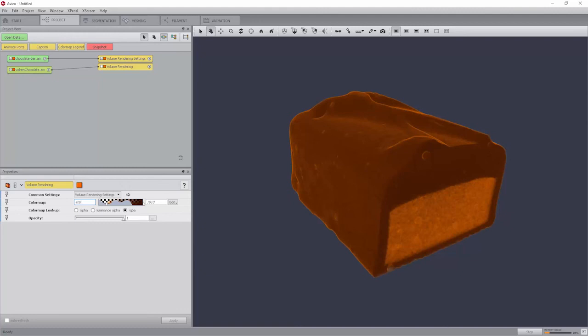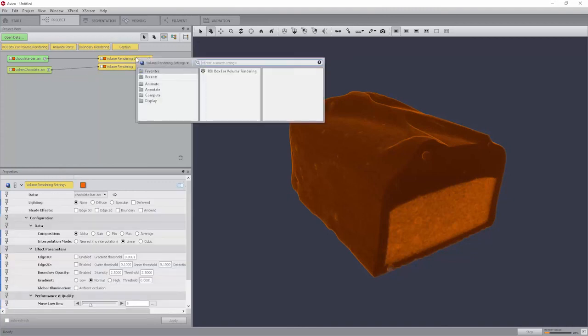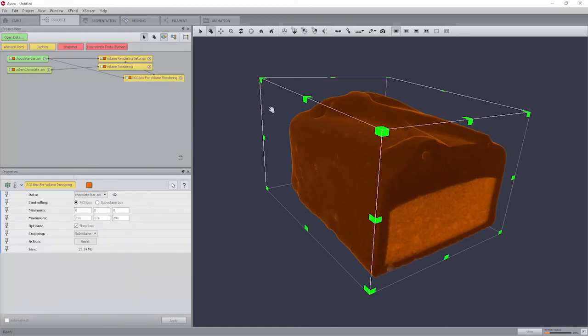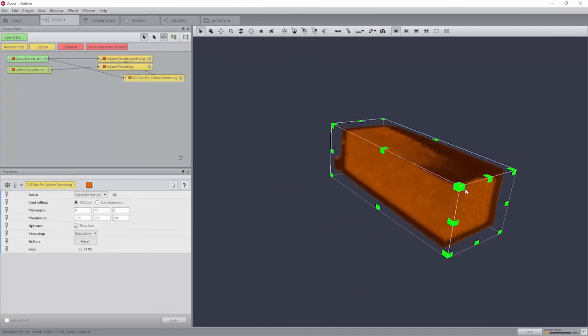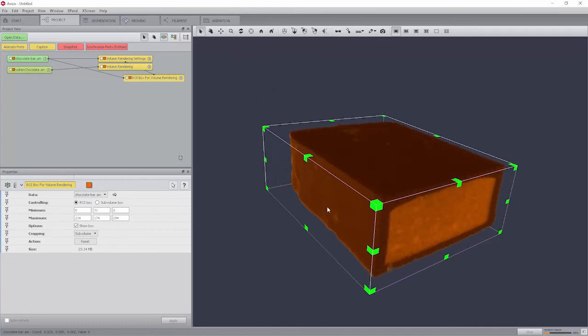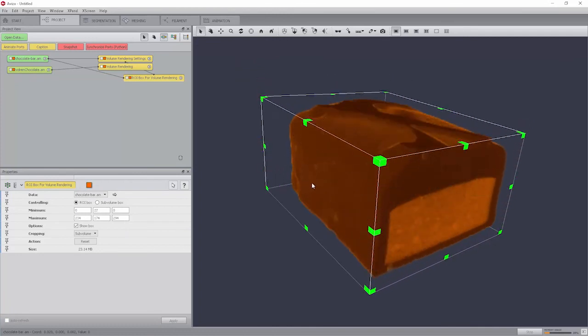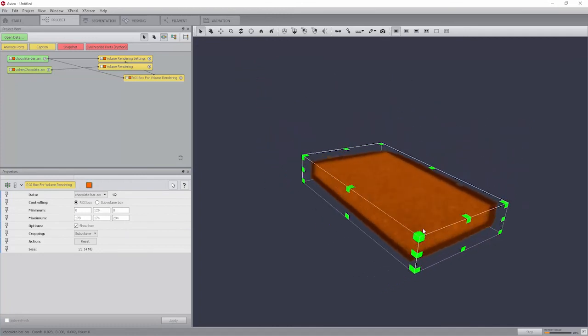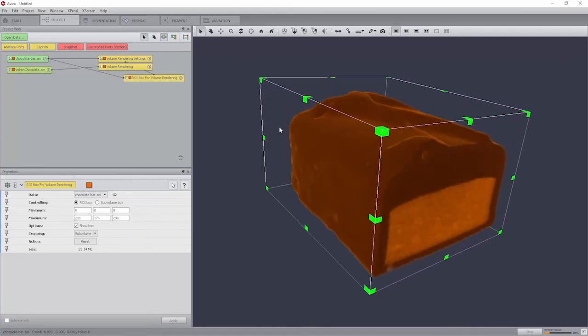It is sometimes interesting to visualize only sub-volumes from the data. This is made possible by right-clicking on the volume rendering settings module and creating a region of interest box from volume rendering module. The box can be modified interactively and used for example to display only the part of the image that is inside or outside of it.